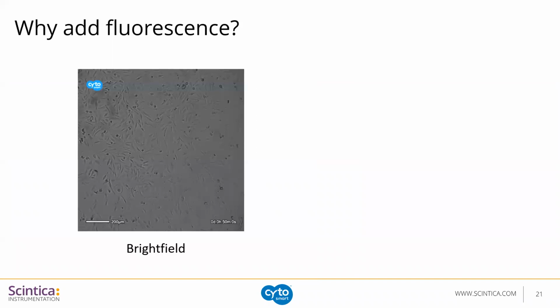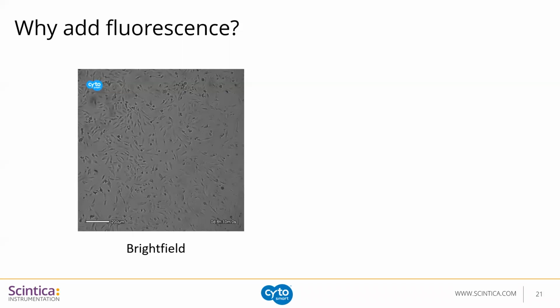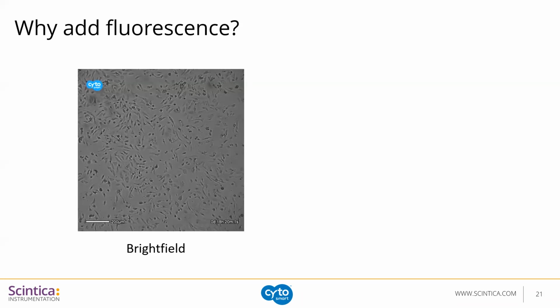Okay, so why add fluorescence? To explain this, I like to show this nice bright field video that can be acquired on the Lux2. We can nicely visualize the cells here. There's a bit of division, a bit of movement, but overall not a lot happening over quite a long period of time, about 1 day.